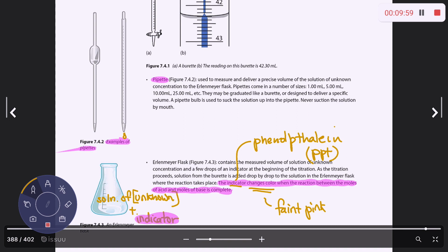It's colorless when it has a pH less than about 8. And then it turns pink around 8.1 or so. And that signals the end of your titration. Okay, if it goes to a hot pink, you're probably at a pH of like 9, maybe 10, depending. Okay. All right, now let's take a look at the next page, the last page.